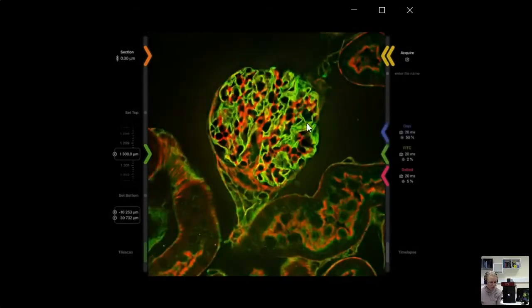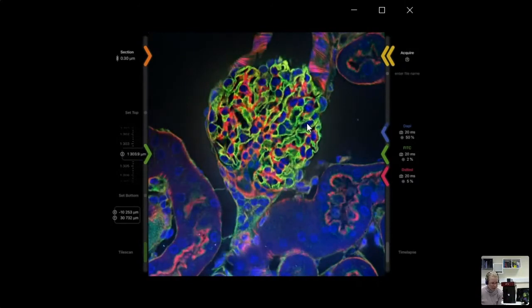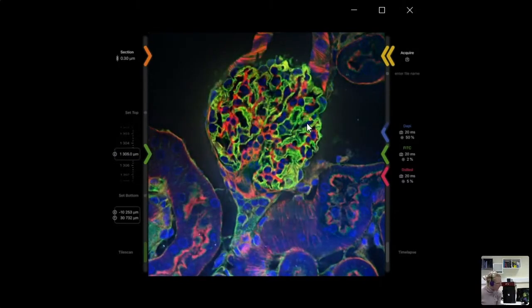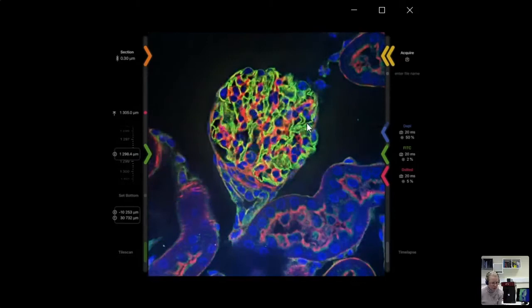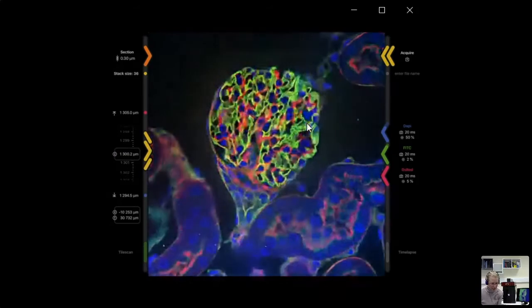All the sliders where I'm adjusting things have a little indication: when it's in the middle and fully colored in, you're at the optimal position - that gives you Nyquist sampling. But if you wanted to go a little lower or higher, you have freedom to do that. As shown before, you can do one, two, or three channels. It's set up for DAPI, FITC, and TRITC as standard. Then we can focus through our sample and set up our Z-stack - navigating to the top to set the top position.